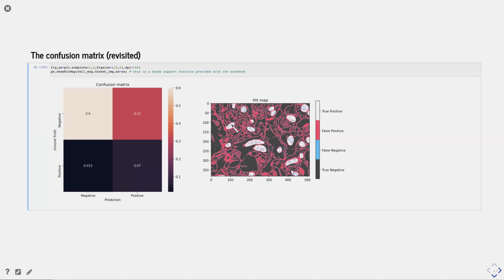segmented this data. You can also see here that there's a big imbalance between false negatives and false positives, meaning we are clearly saying that there is a lot more mitochondria than there should be. Ideally, you should push both of these to as small values as possible. The ratio between those two could be true that they actually are like this.